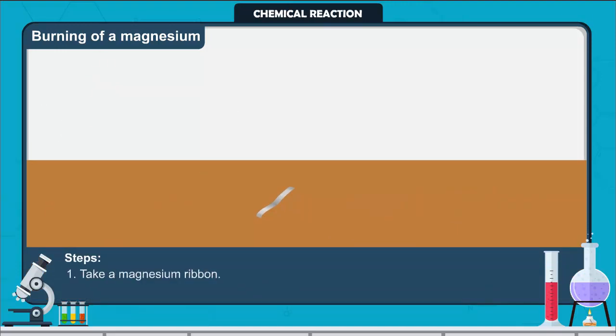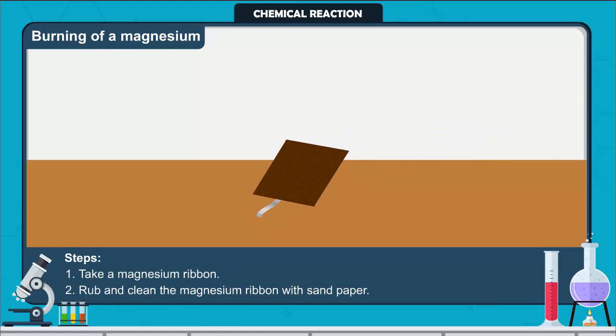Follow these steps. Take a magnesium ribbon. Rub and clean the magnesium ribbon with sand paper. This is done to remove the protective layer of basic magnesium carbonate from the surface of the magnesium ribbon.